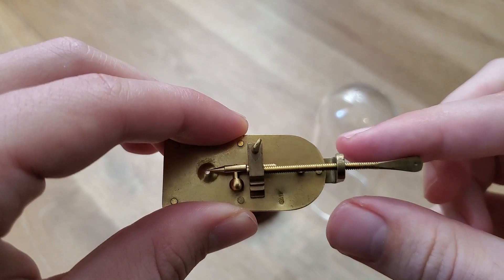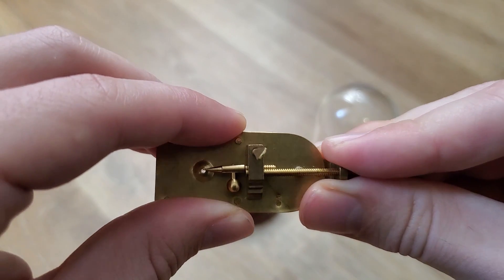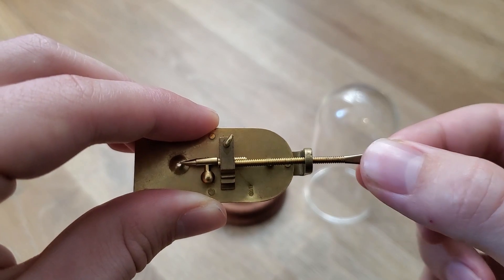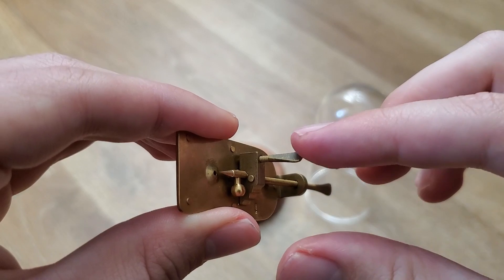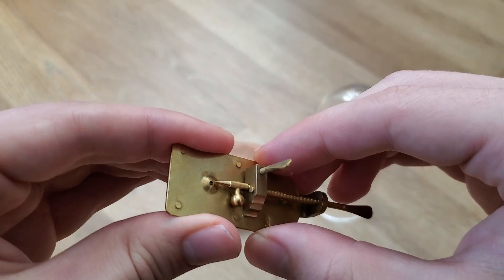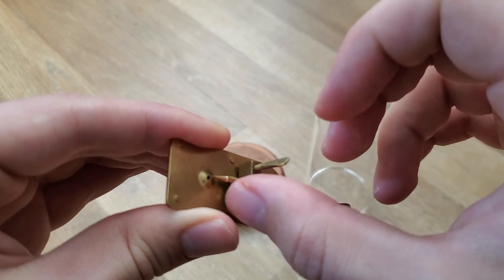So, first off, you have the lateral adjustment here, which sweeps through. There's also what we'll call the Y adjustment, in and out, by turning this screw here. There is a Z adjustment, up and down, which lifts this whole block up. And finally, there is a rotational adjustment on the sample, using this pin here.